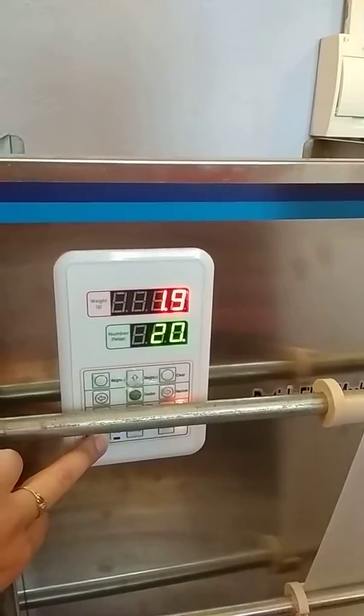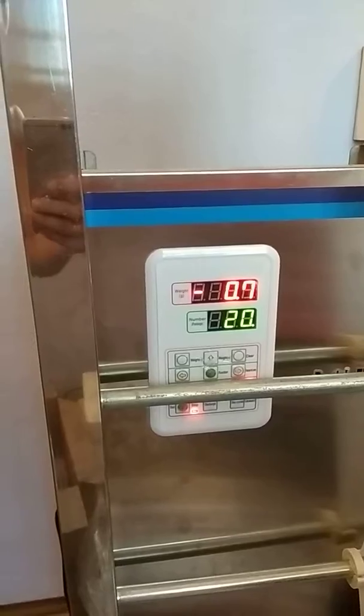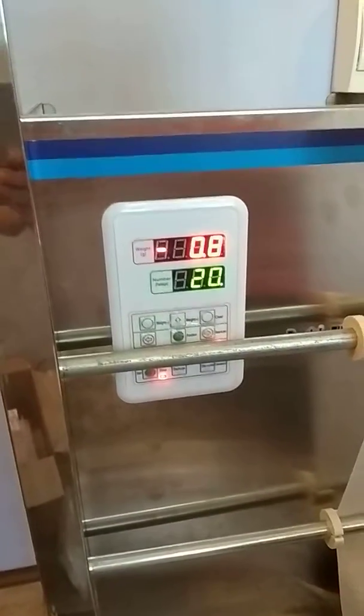Now we push stop and the weight is already showing minus 0.8, which is not correct.